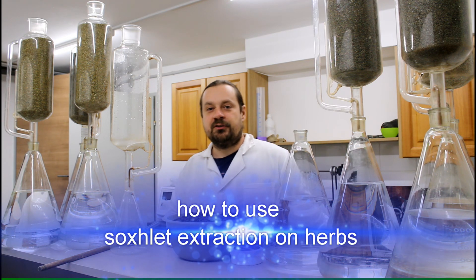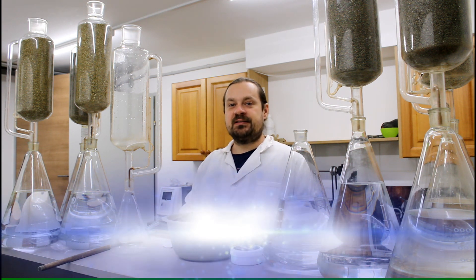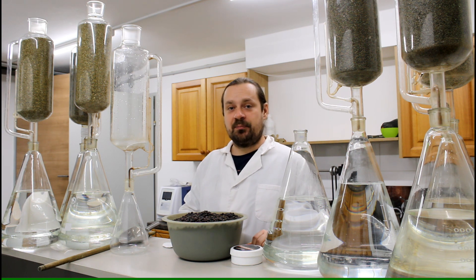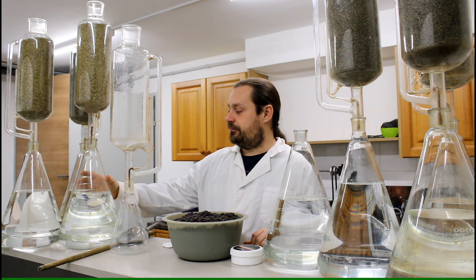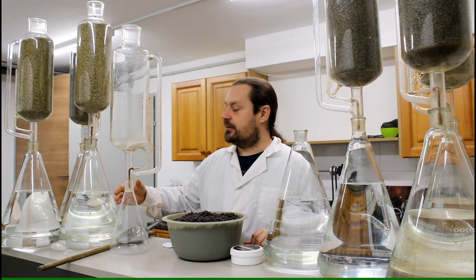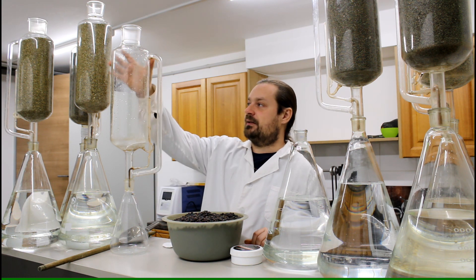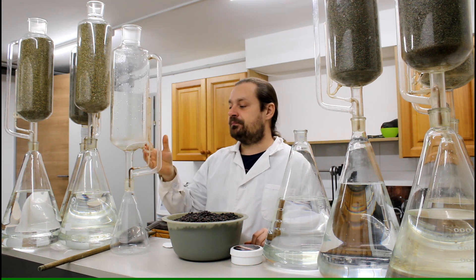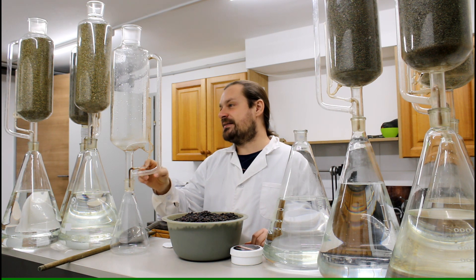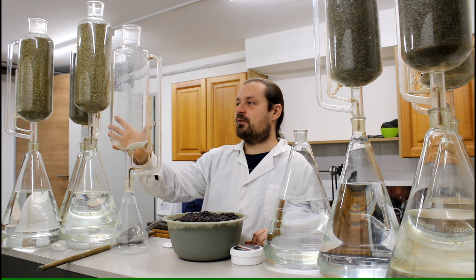Hello everyone, today I'm going to show you how to produce herbal tincture with the Soxhlet extraction method. It's actually fairly simple. All that you need is a Soxhlet extraction apparatus, which usually consists of three components: the boiling chamber, which contains the actual solvent — in my case a mixture of ethanol and water — then in the middle this extraction tube, which you can see here, where the material we want to extract is placed inside.